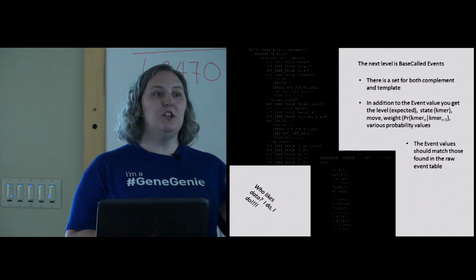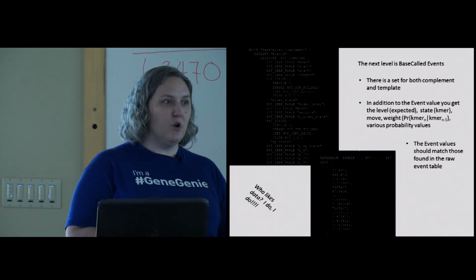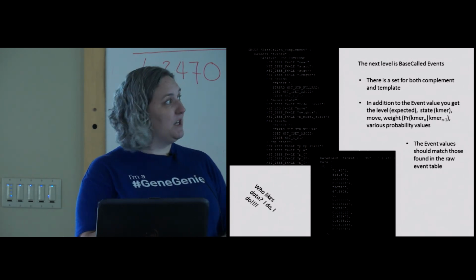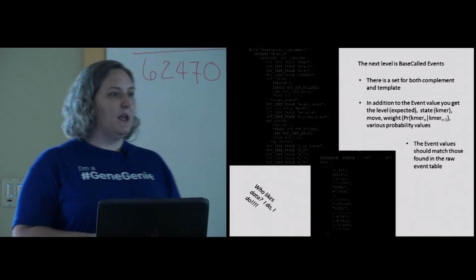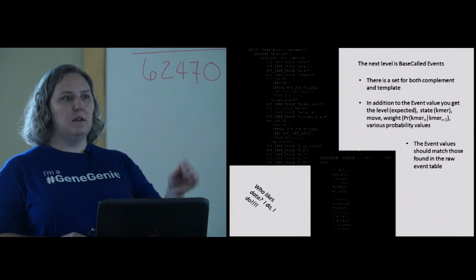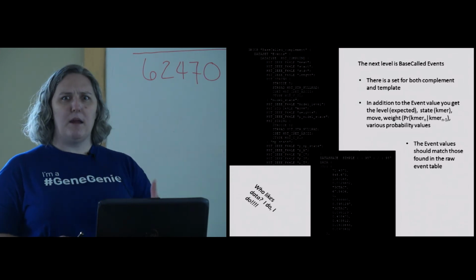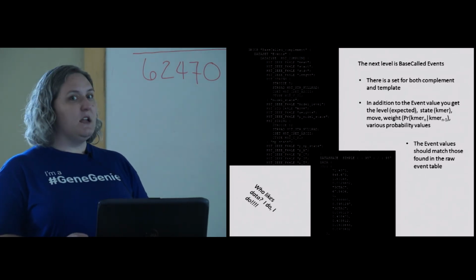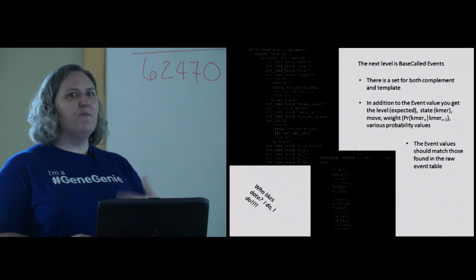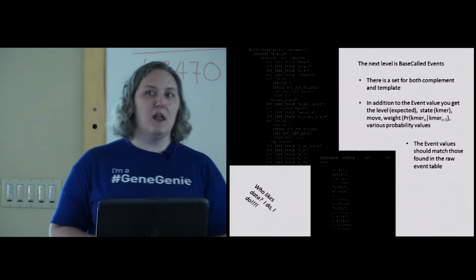We would expect each additional step to be 1, because that means it's moved 1 base based on what they predict this 5mer is and what the previous 5mer was predicted to be. If you see 0, then maybe it's dwelling longer. Maybe you're seeing a weird polymeric sequence. This is going to be true for your homopolymers. If you see 2 or 3, then you've missed events in there. So that's used in some of the more sophisticated methods of aligning this sort of data.